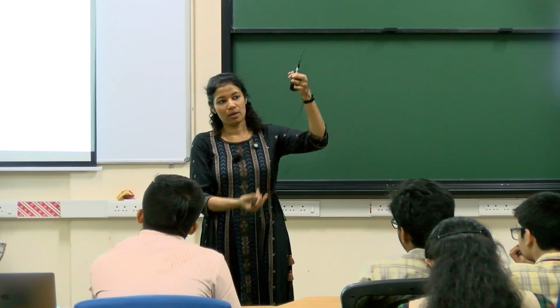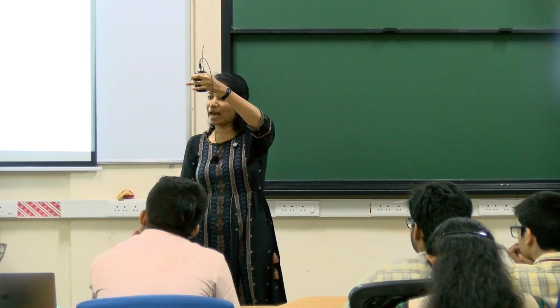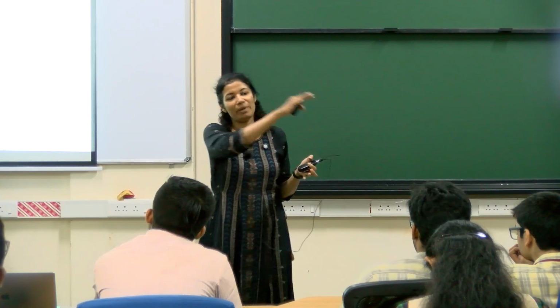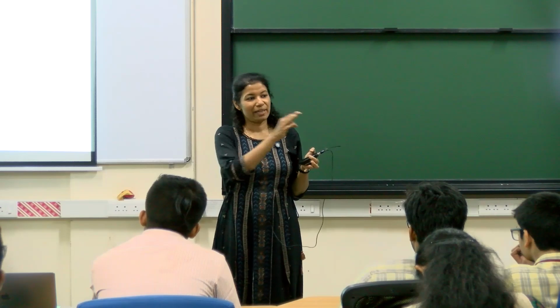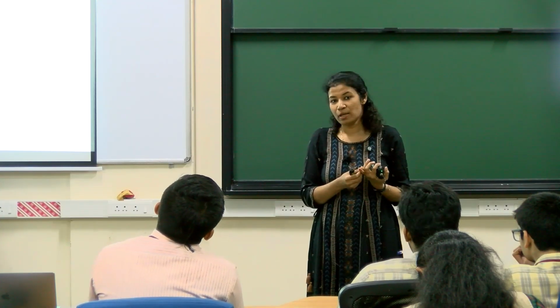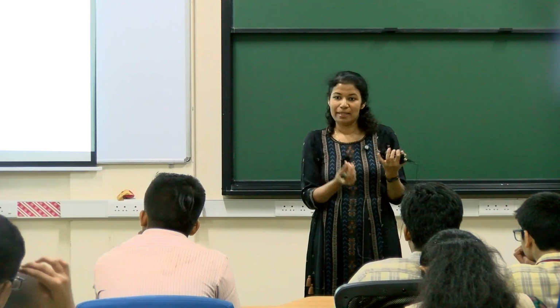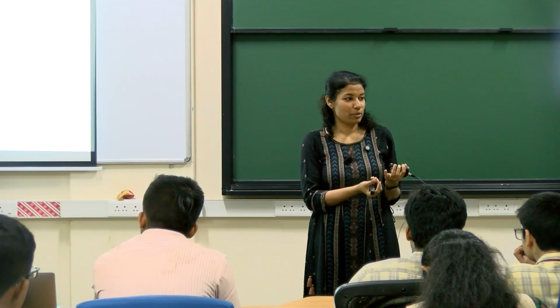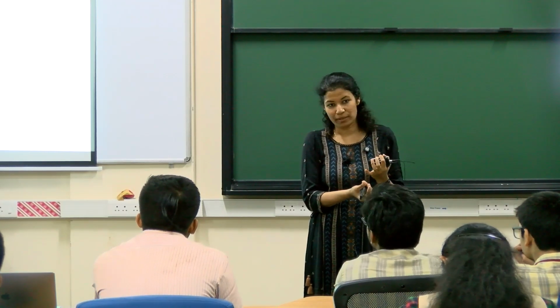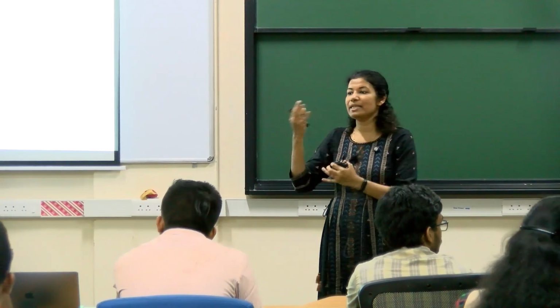So if you have a tree, you can take the height of the image, you divide it by the height of the object. That will give you how many times you have magnified the object. So normally when you're looking in a light microscope, what you would have seen an onion cell, you will generally have a 4 or 10x eyepiece, and then you will have a 60 or 100x magnification objective. So if you combine these two, you can increase the magnification.